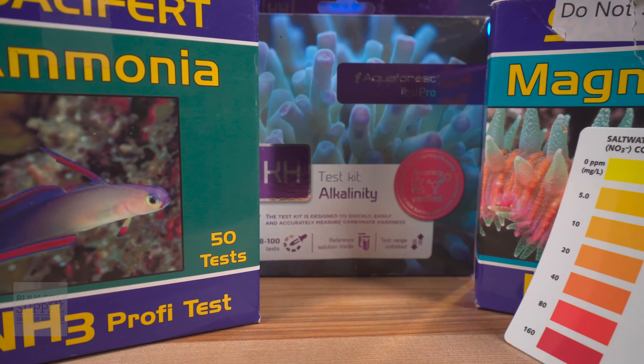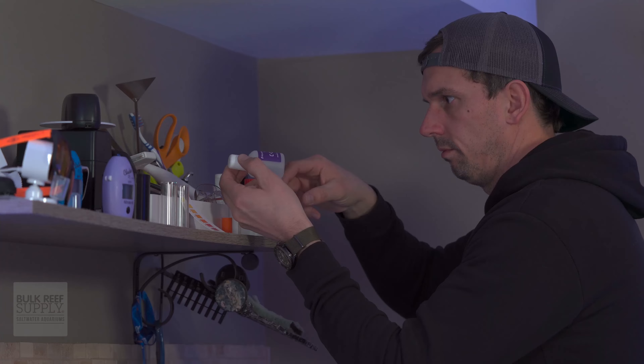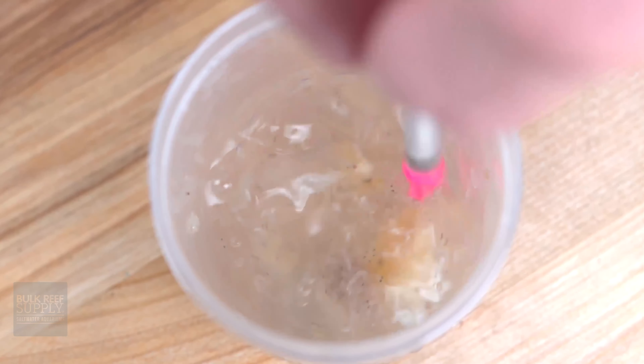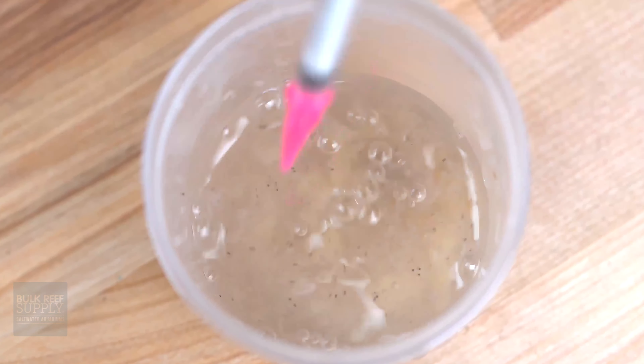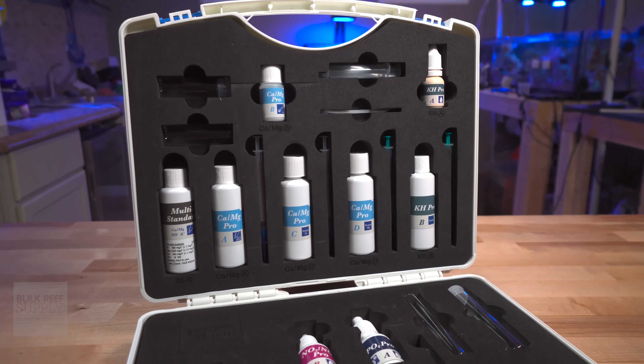We've all been there purchasing individual test kits over time. The testing syringes pile up, the reagents get lost, and now you're wondering if you're going to get an accurate test result because the syringe you're using was once used to swish around some frozen fish food. I've said it before and I'll say it again — make this hobby as easy as you possibly can on yourself. The Tropic Marin Professional Lab Test Kit does just that.